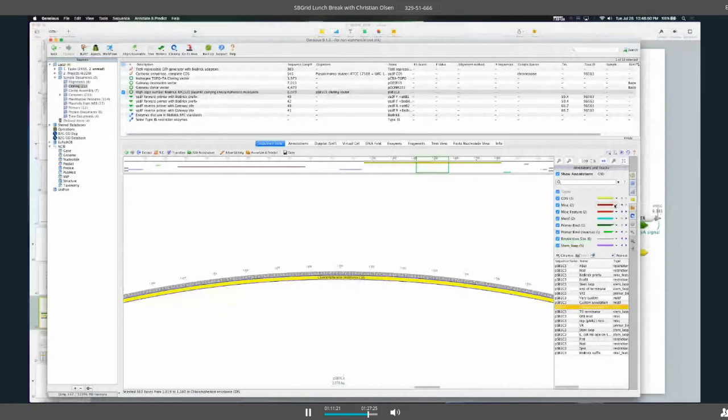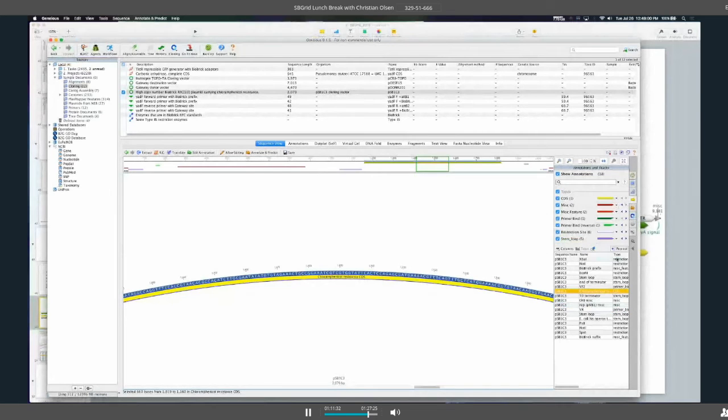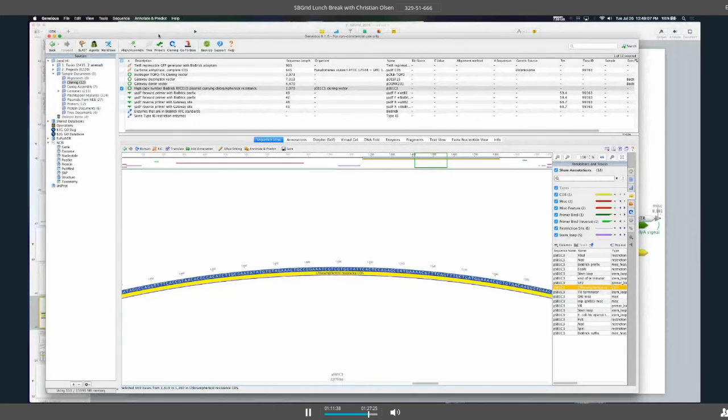To delete annotations, it's also trivial. Over here in the annotations and tracks box, I can select the drop down underneath the color, and that exposes a number of options such as delete. So I can delete all motif annotations, and you'll see that they're all gone. Okay.